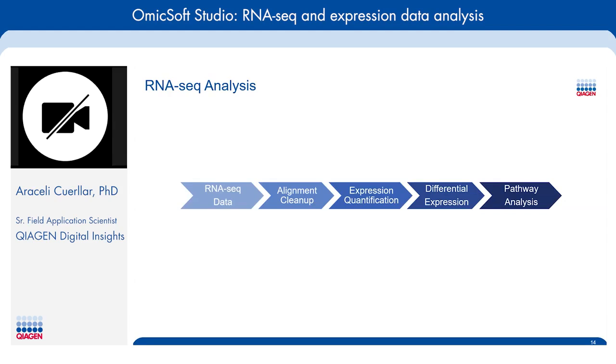And so basically, for those of you that are not, a pipeline for RNA-Seq analysis typically consists of mapping sequencing reads to your reference genome, and then it involves performing some QC analysis, quantifying the expression levels of genes and transcripts, performing a differential analysis of gene expression among different biological conditions, and then performing biological interpretation of differentially expressed genes using pathway analysis or a gene set analysis.